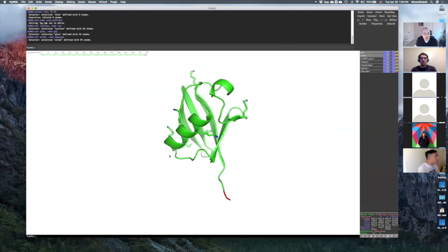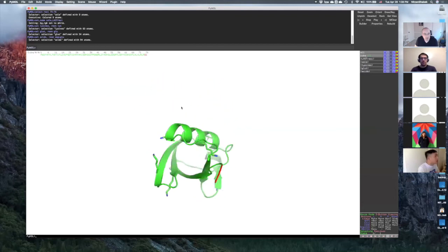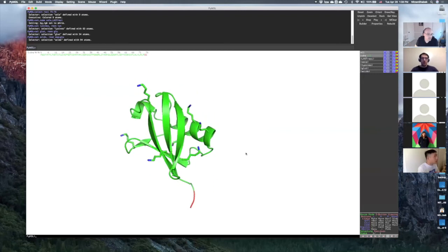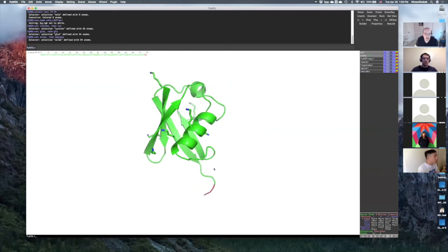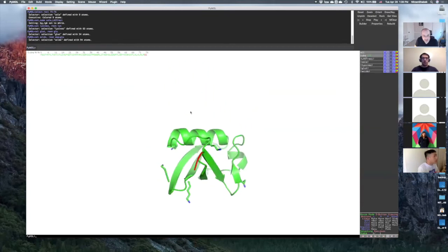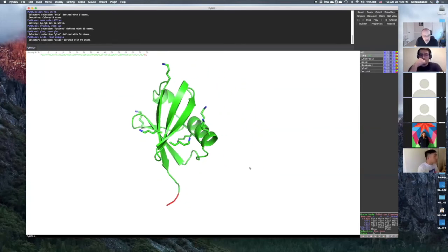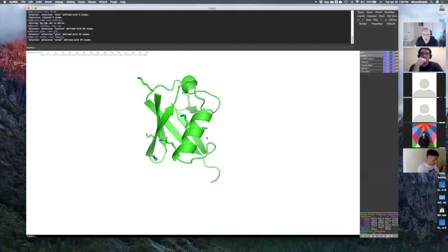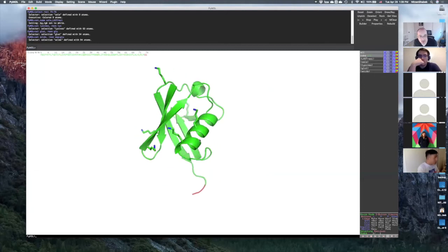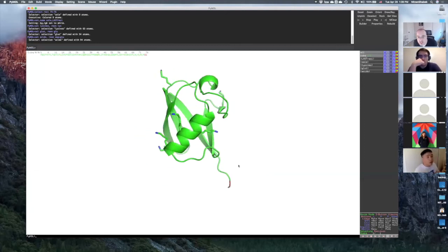Now click on somewhere else, and I want you guys to appreciate what's happening here. These lysines are the most important lysines in ubiquitin biology, right? But one lysine is mostly important, which is lysine 48, okay? Try to identify where lysine 48 is.